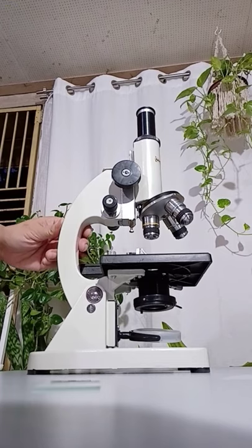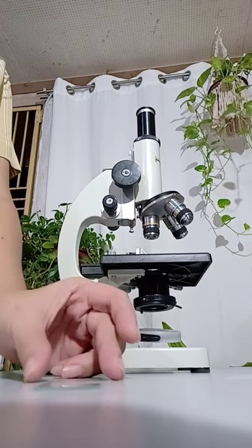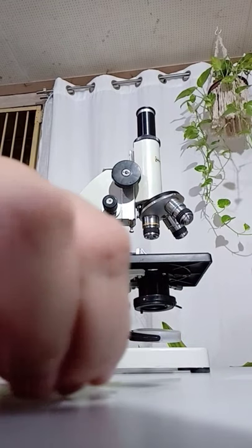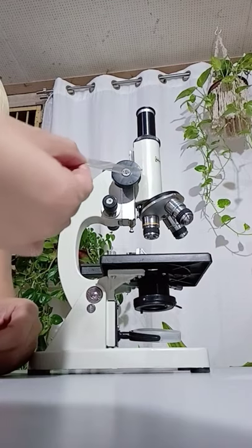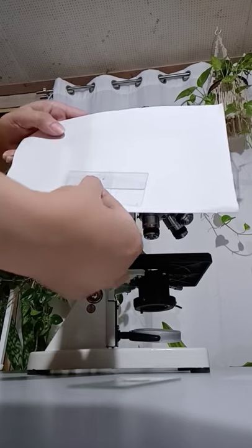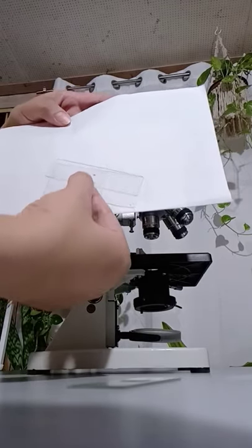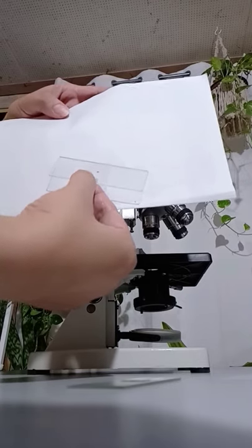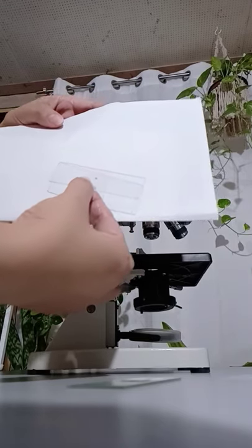How to focus? First, prepare your specimen. There are two kinds of specimen that we can view under the microscope. One is called a fresh mount. I place a drop of water on the glass slide, and I place the cut-out small letter E above the drop of water, and I covered it with a cover slip.